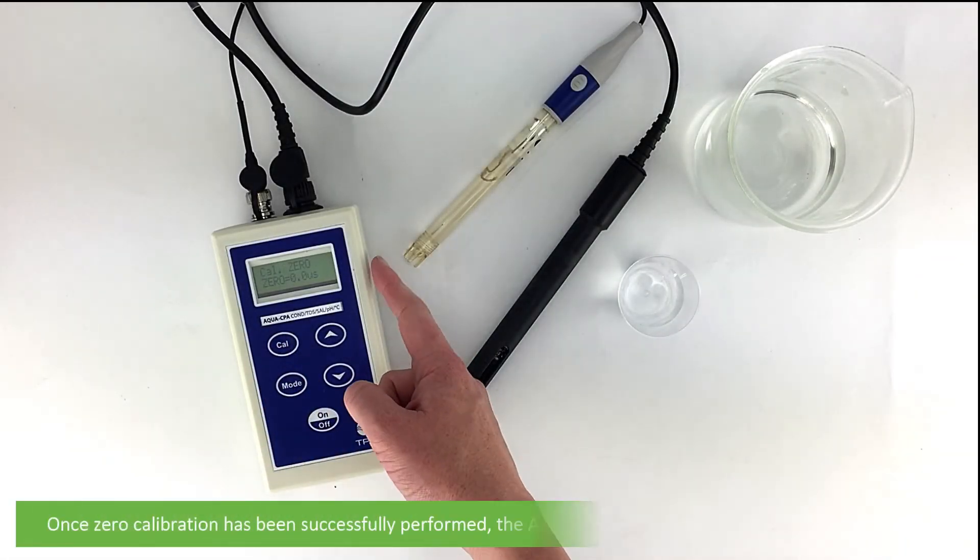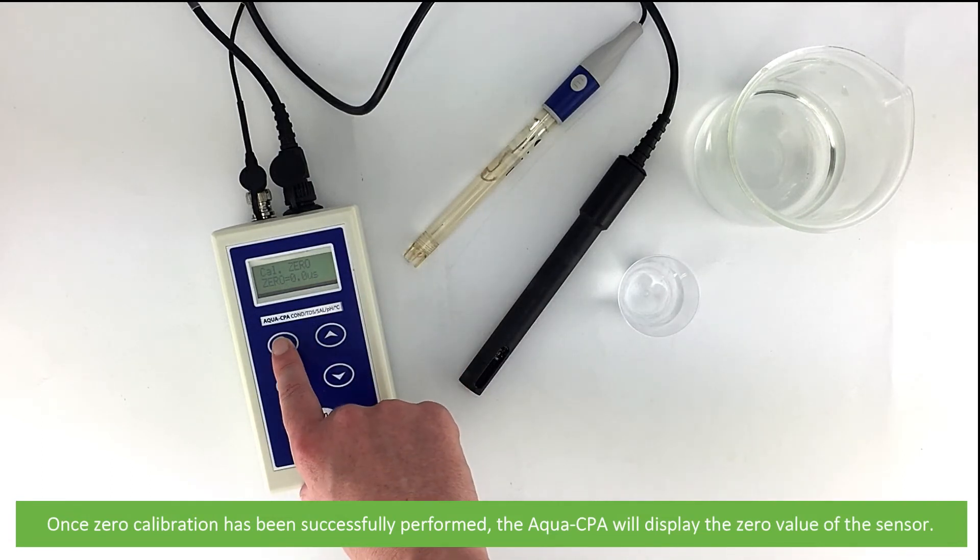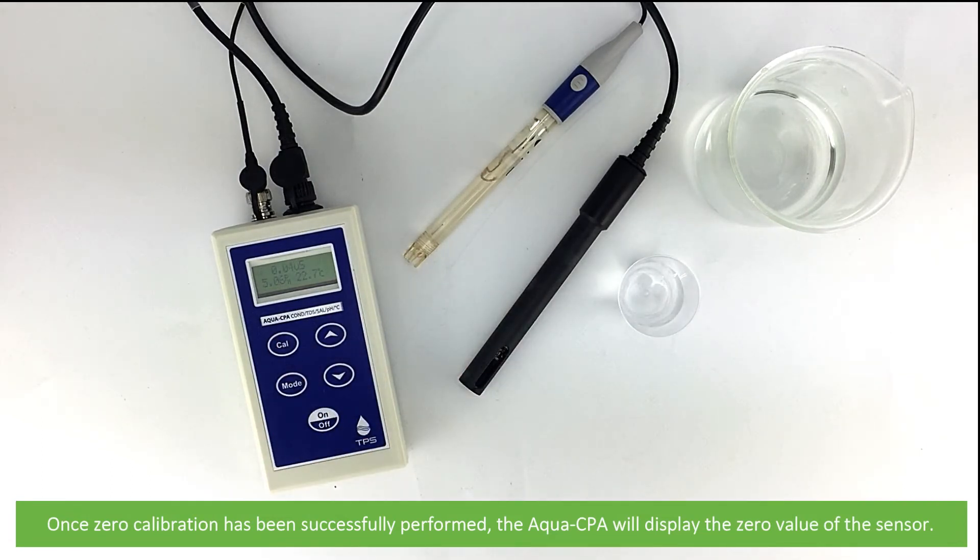When the reading is stabilized at or near zero, press the CAL key. Once zero calibration is successfully performed, the Aqua CPA will display the zero value of the sensor.